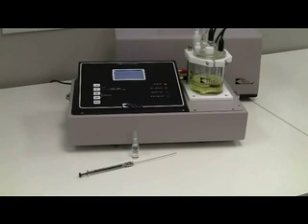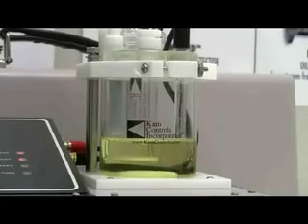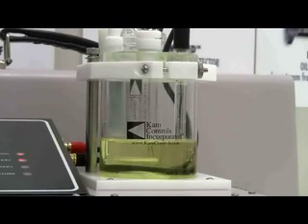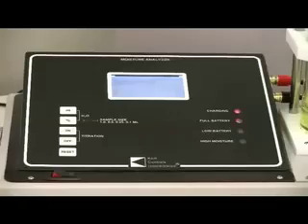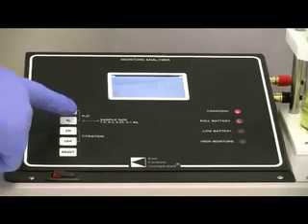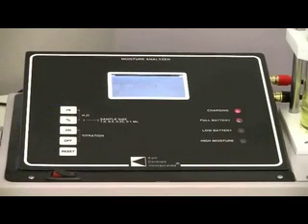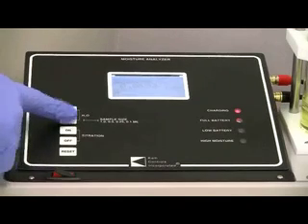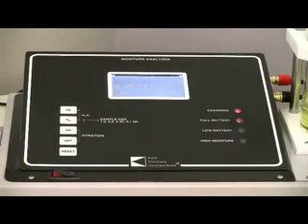You must first determine your sample size according to the instructions given in the manual. When you have determined the appropriate sample size, input it into the moisture analyzer by repeatedly pressing the button marked with the percent sign for sample by volume, or the button marked with the microgram sign for sample by weight. The display will scroll through available sample sizes. Stop when the display reads the desired sample size.